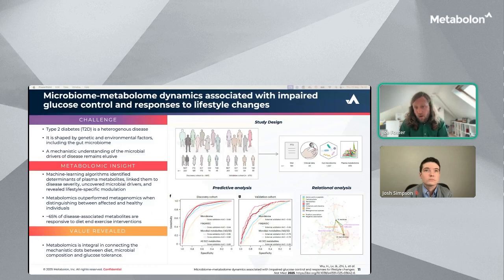The discovery cohort used here was from the Impaired Glucose Tolerance Project, and the validation cohort was the Swedish Cardiopulmonary Bioimage Study. Highly recommend this paper to you all. Take a screenshot now if you'd like to know what that is and have a read.